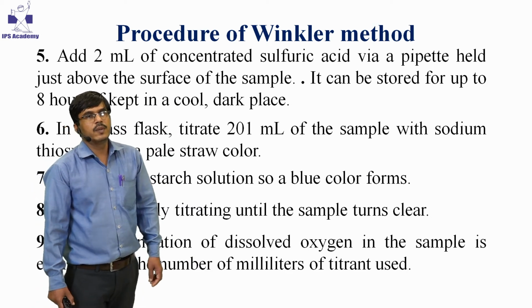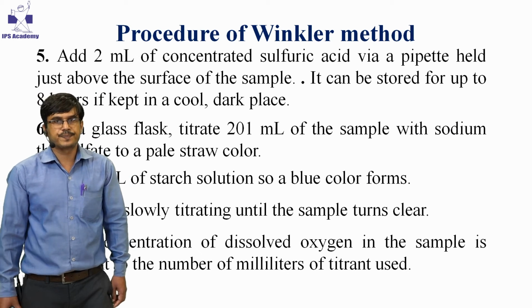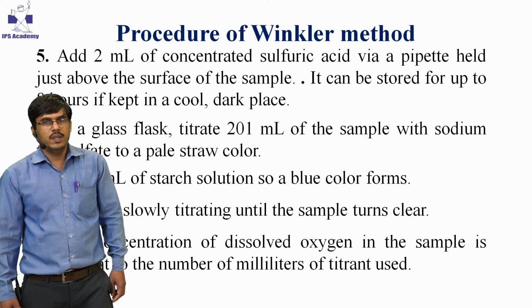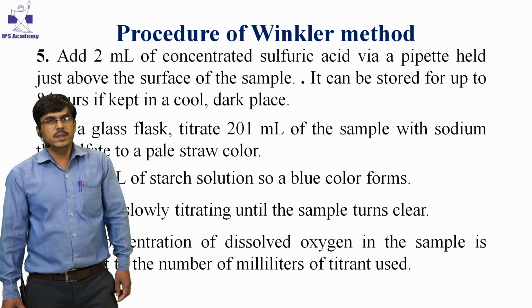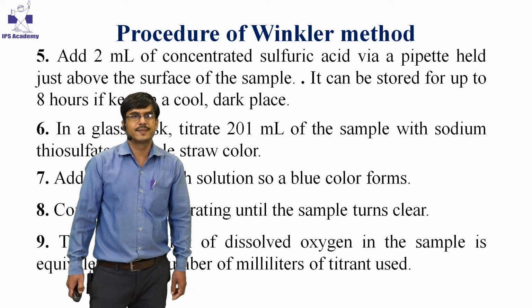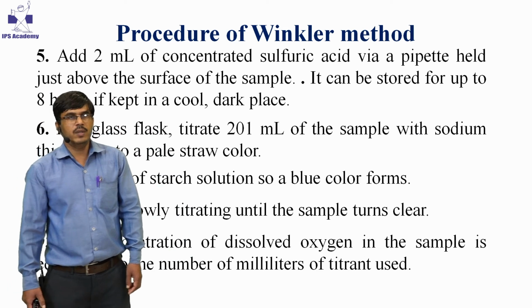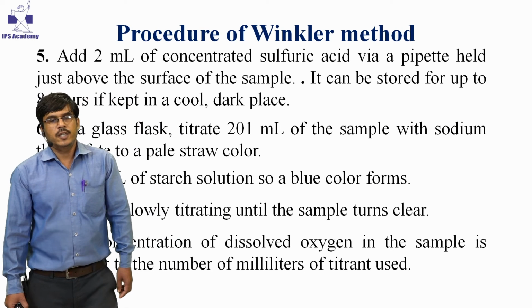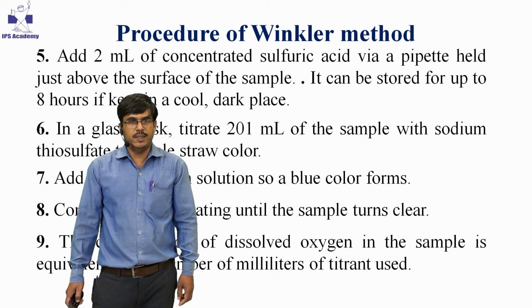In the next step, we have to add 2 ml concentrated sulfuric acid in a manner that no oxygen dissolves from the environment into the sample. This mixture can be stored for 8 hours if kept in a cool condition and dark place.